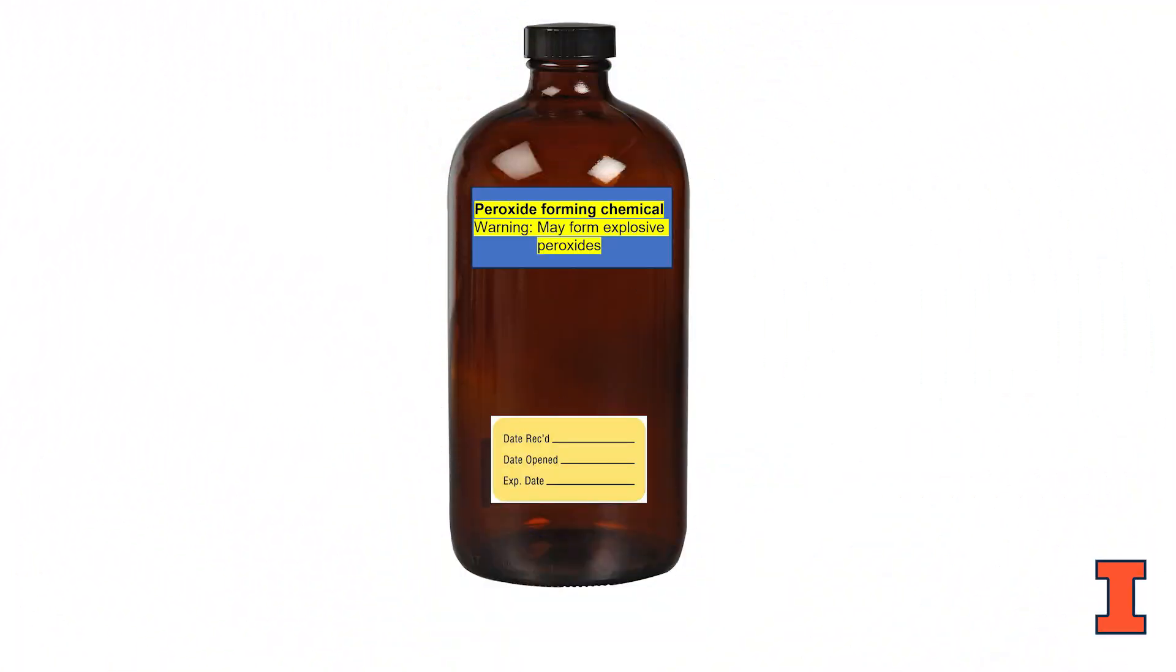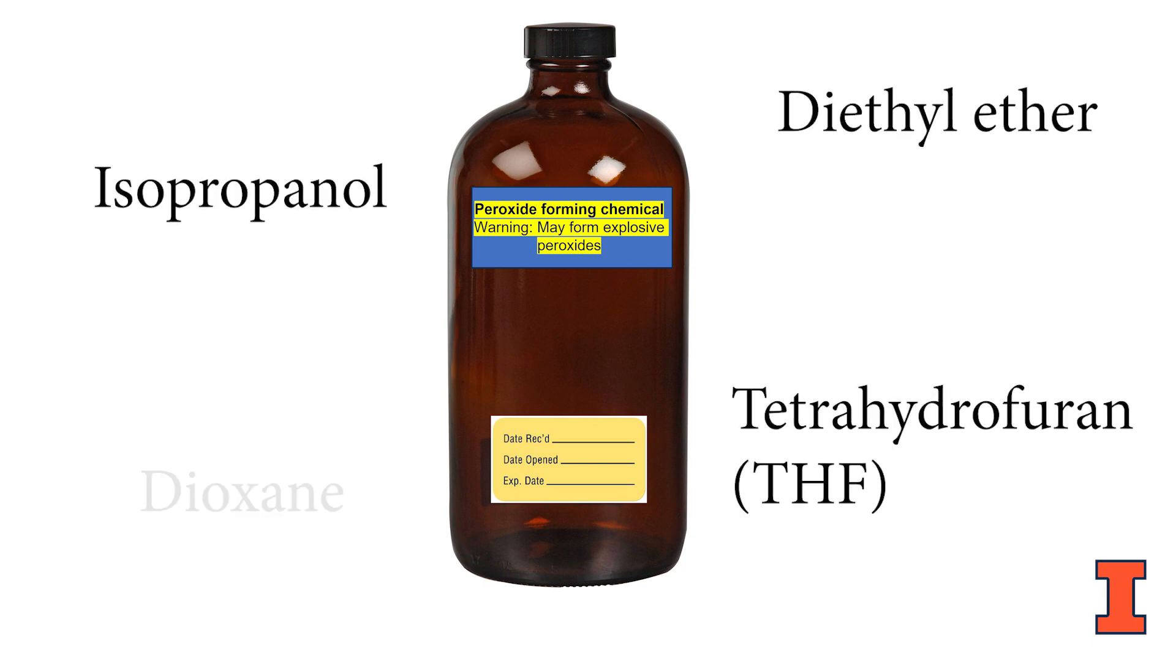Most common peroxide forming chemicals found on campus are isopropanol, diethyl ether, tetrahydrofuran and dioxanes, all of which are required to be tested for the levels of peroxides annually.